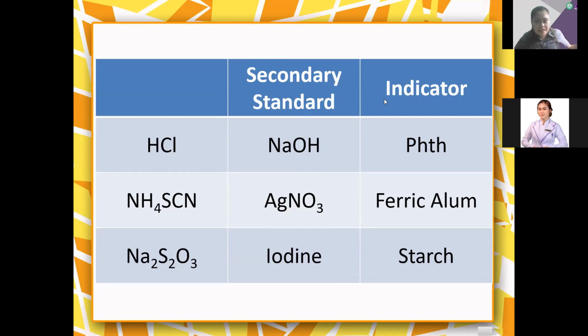Yeah. In secondary standard or pag secondary standard, in here, the sodium hydroxide will become the titrant. Just remember, the titrant is the one being added using a burette. So, siya yung titrant dyan. Pag secondary standard ang gamit natin, ang secondary standard ang magiging titrant. Okay.